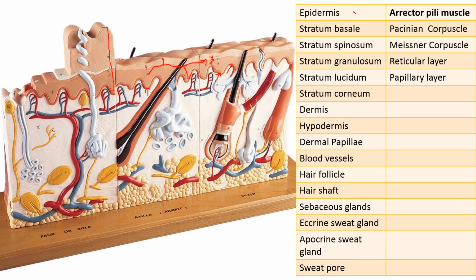All right, so that was the epidermis, the stratum basale, stratum spinosum, stratum granulosum. We saw the stratum lucidum here for the thick skin and the stratum corneum. Okay, can you find the dermis here?